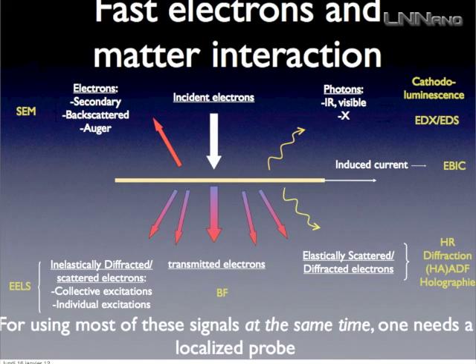This is a very important signal, and it's very important to use with a STEM. It's really like twins, a very good association. With this kind of signal, you can measure collective excitations, like plasmons, or optical signals, or individual excitations, and then you can measure, say, chemical signals. I will give some examples.